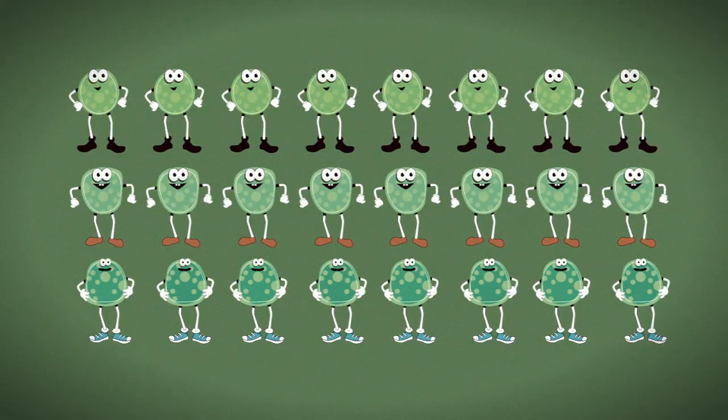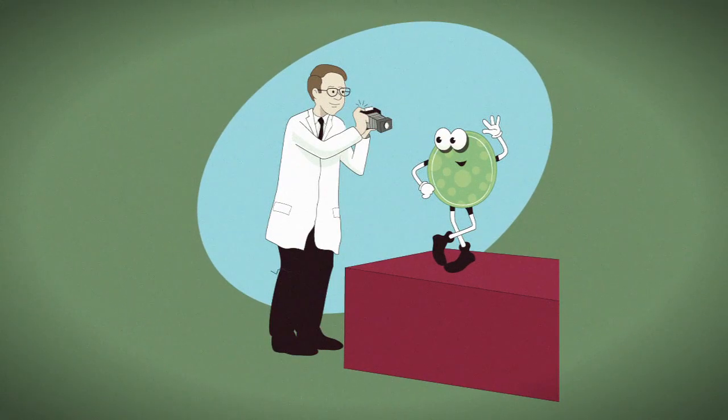There are thousands of species of algae, and they are organized using several different characteristics. One way to distinguish the different types is by the shape. Some possible shapes are round, rod-shaped, or crystal-like. The scientists will also determine if the algae have flagella or cilia. This is where a picture will be taken of your algae and sent to you.